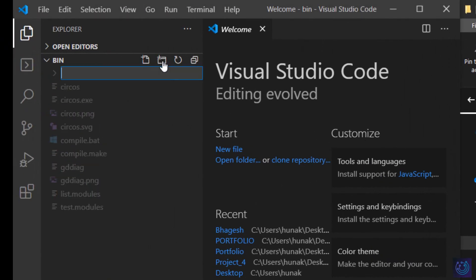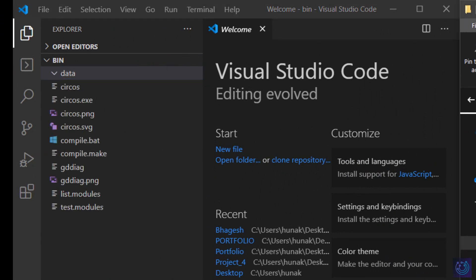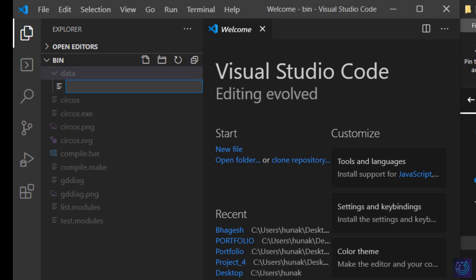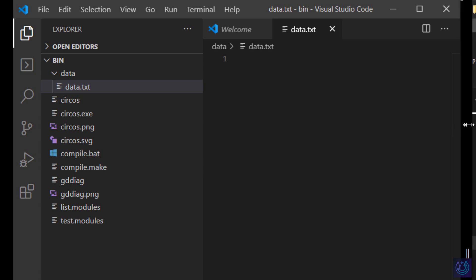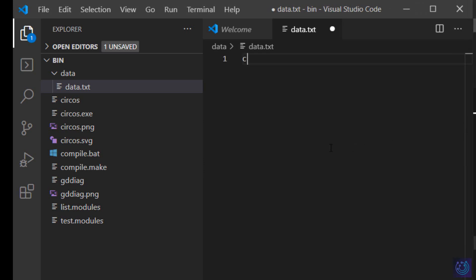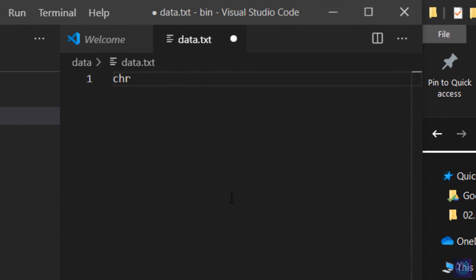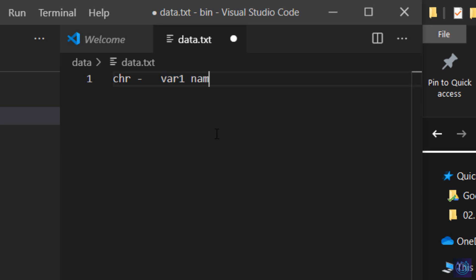Back in the editor, I'll create a folder — you can right-click and create a folder or use Visual Studio Code. Click on 'Create Folder' and type in 'data'. This folder will hold the karyotype files or karyotype data. I'll create a new file here and name it 'data.txt'. Our data would usually have six to seven columns — the first column will contain 'chr', tab, hyphen (it's a tab, not a space), and then 'var1' as the identifier. The identifier should be unique for each entry, followed by the chromosome name.